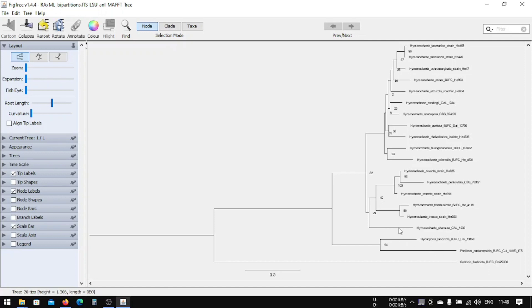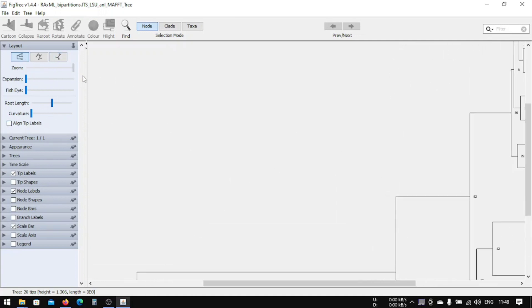This is the topology of the tree that we are looking at. Now you can zoom in to examine the support values on the nodes.